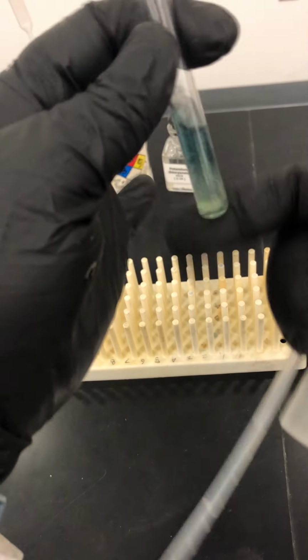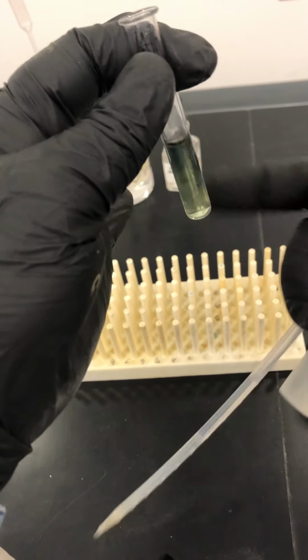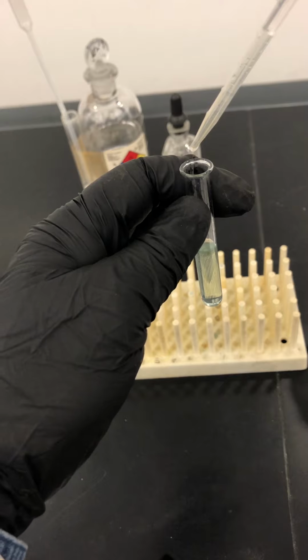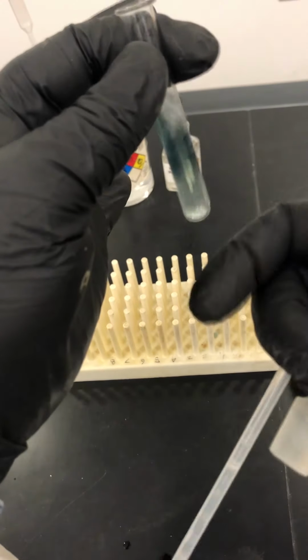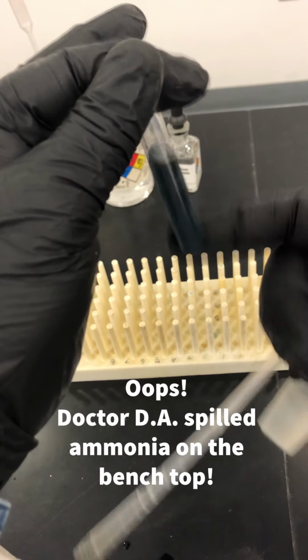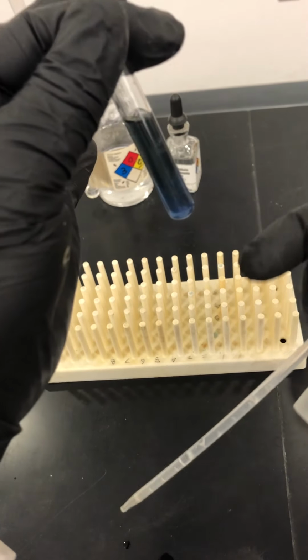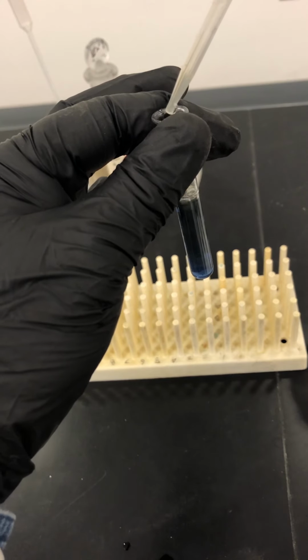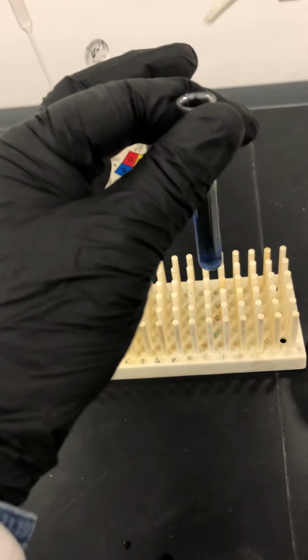And then mix it. And you can see something happening already, right? Then it goes away. Let's add some more drops. There you go. It is forming a dark blue solution now. Let's add a little more just to get the full effect. A few more.